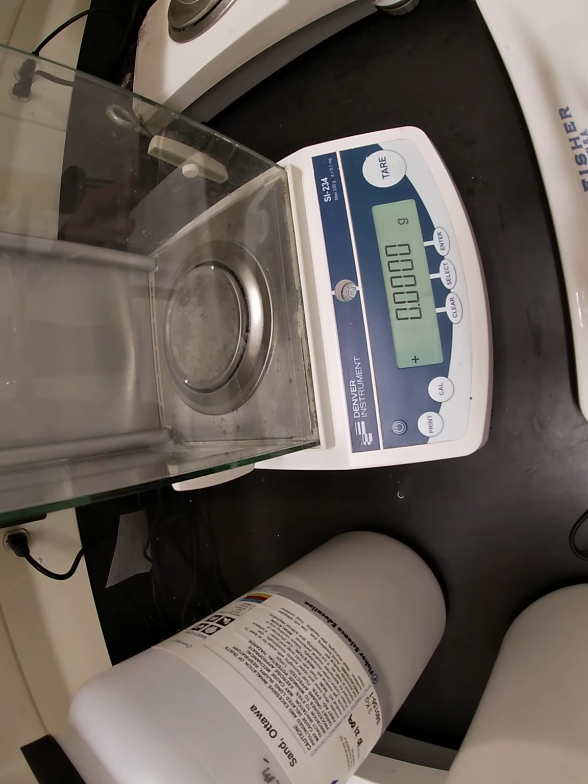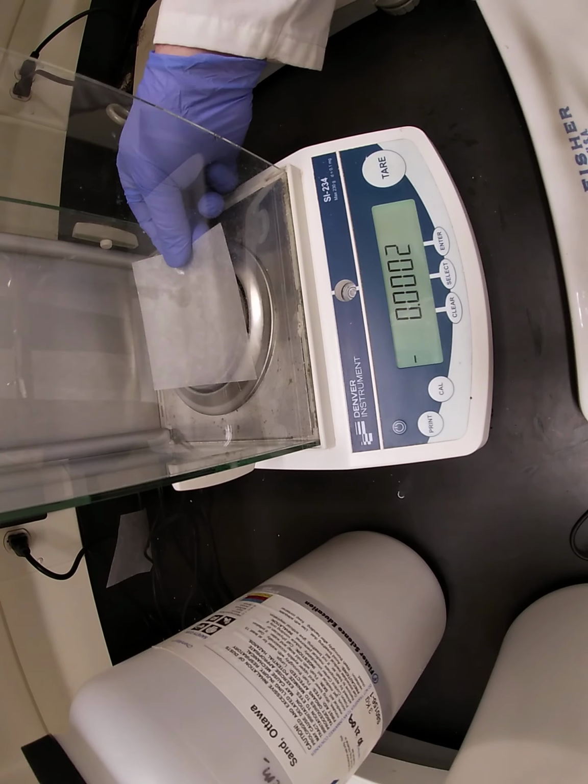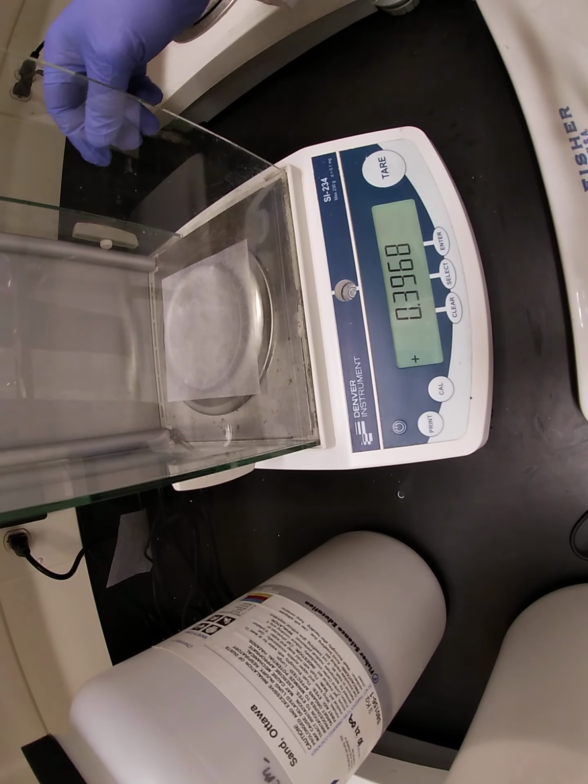Okay, here we are in the balance room again, and we are going to do some measurements to make our mixture for our separation of mixture lab. So we're going to mix 3 different chemicals together, a couple of which you're very familiar with. In order to do that, we're going to weigh out somewhere around 0.8 grams of each one.